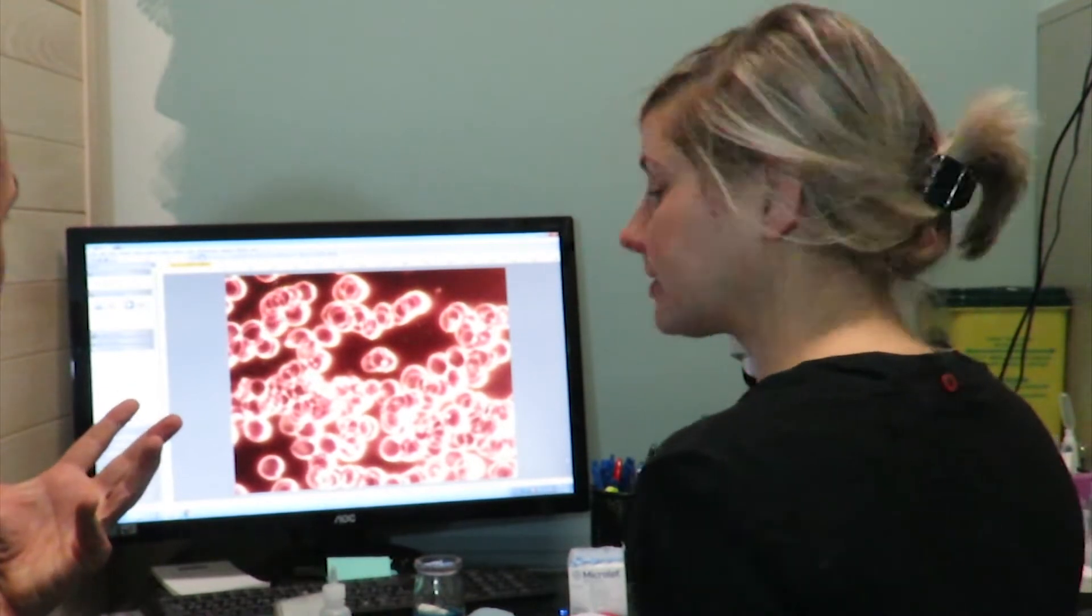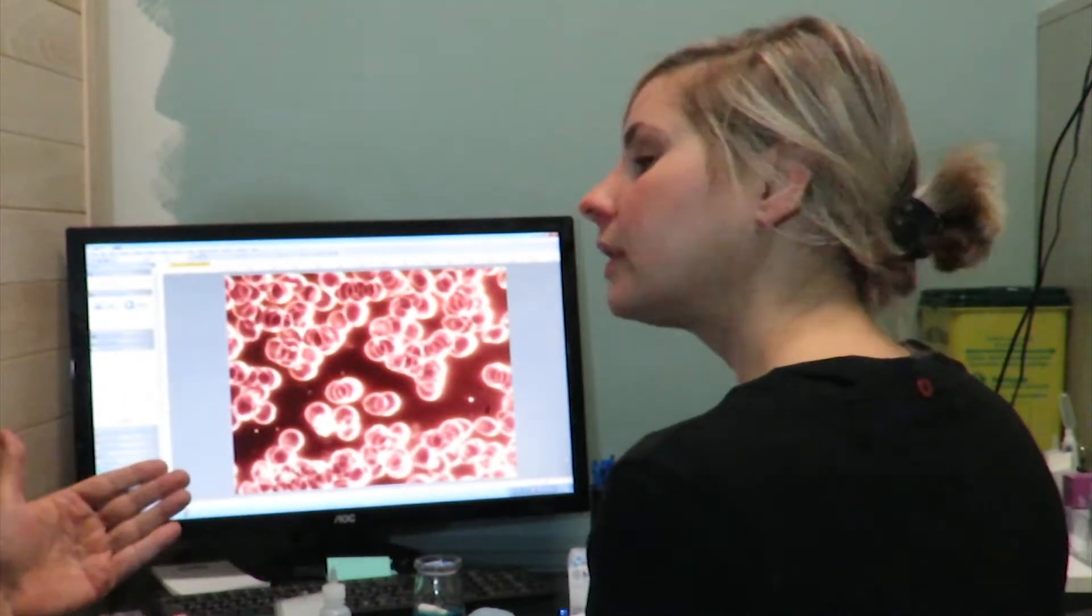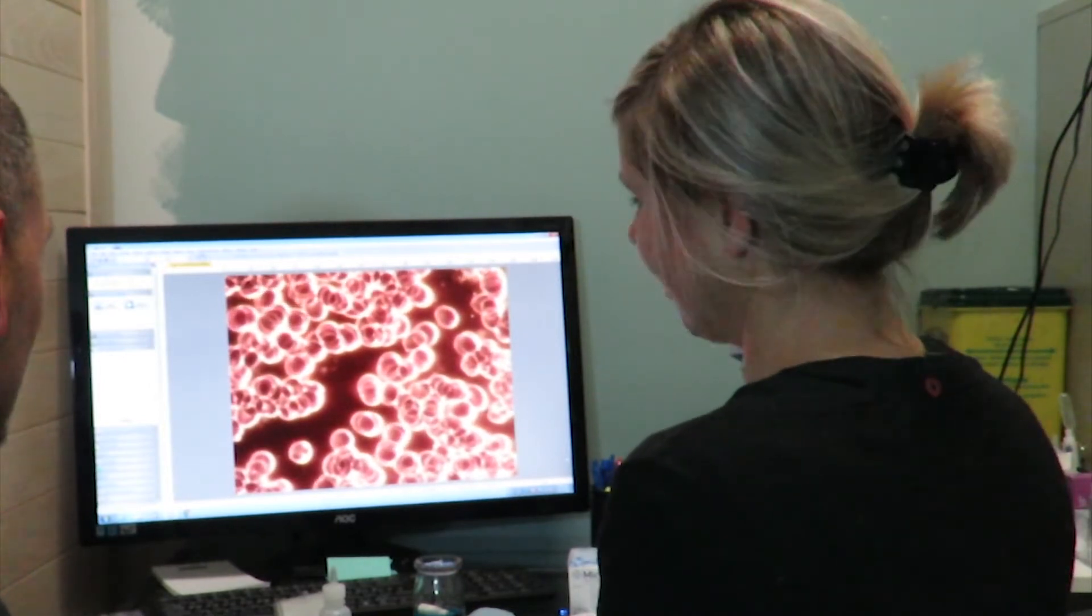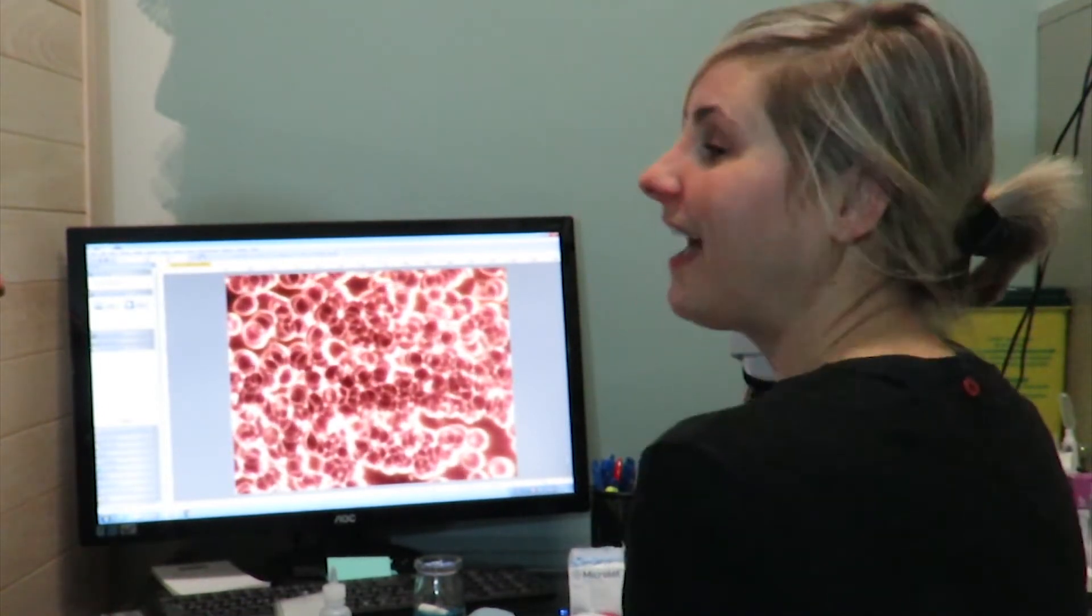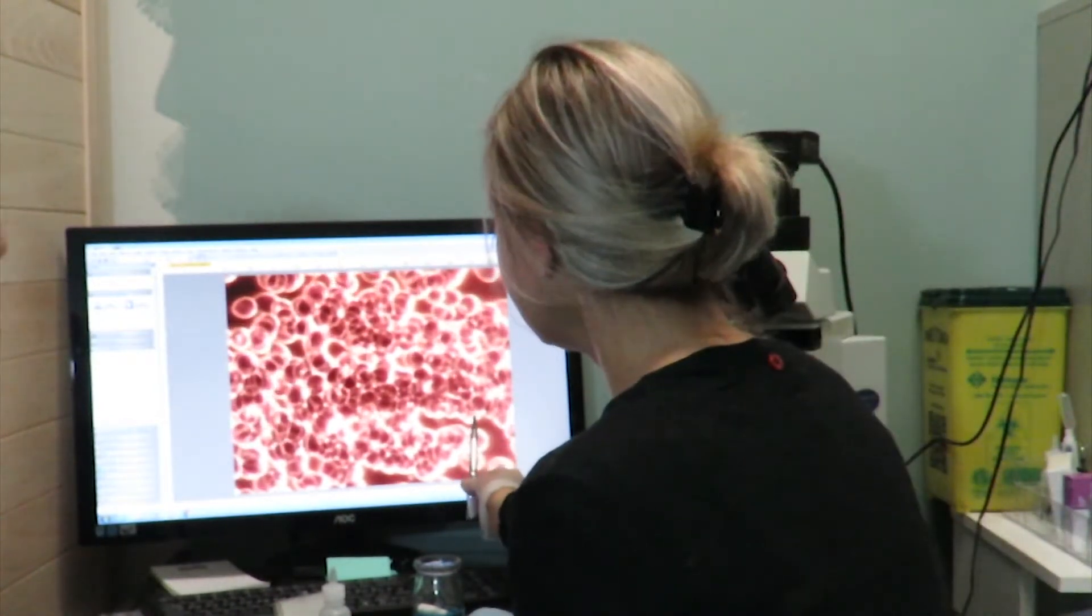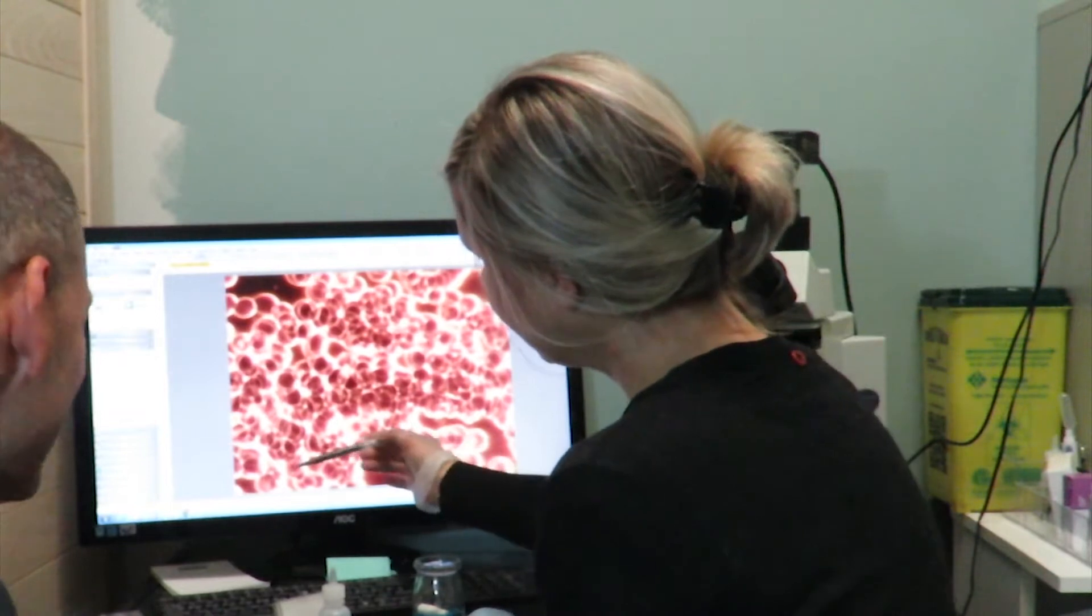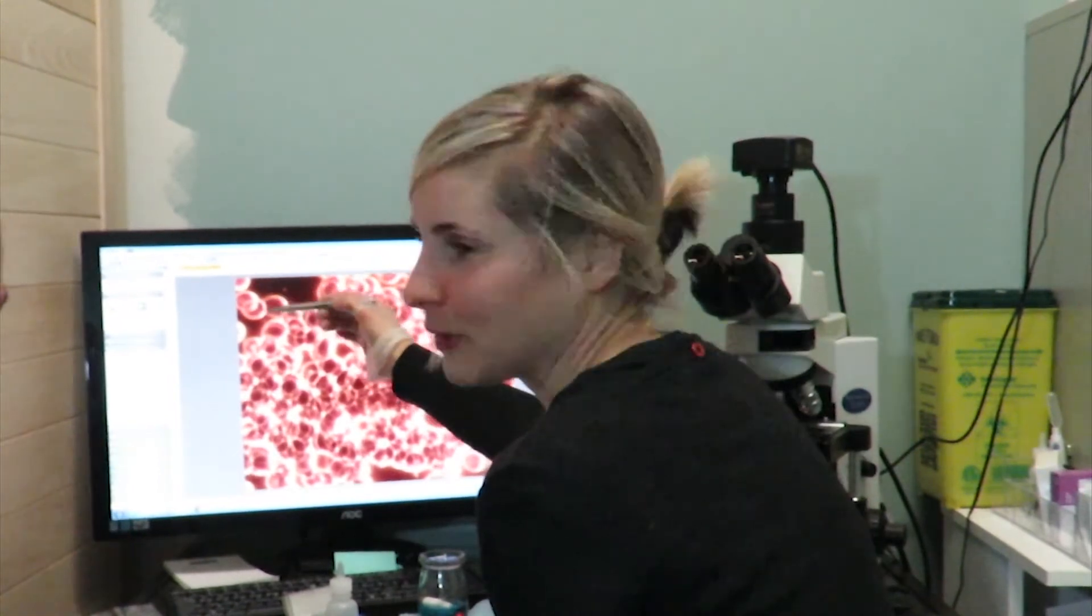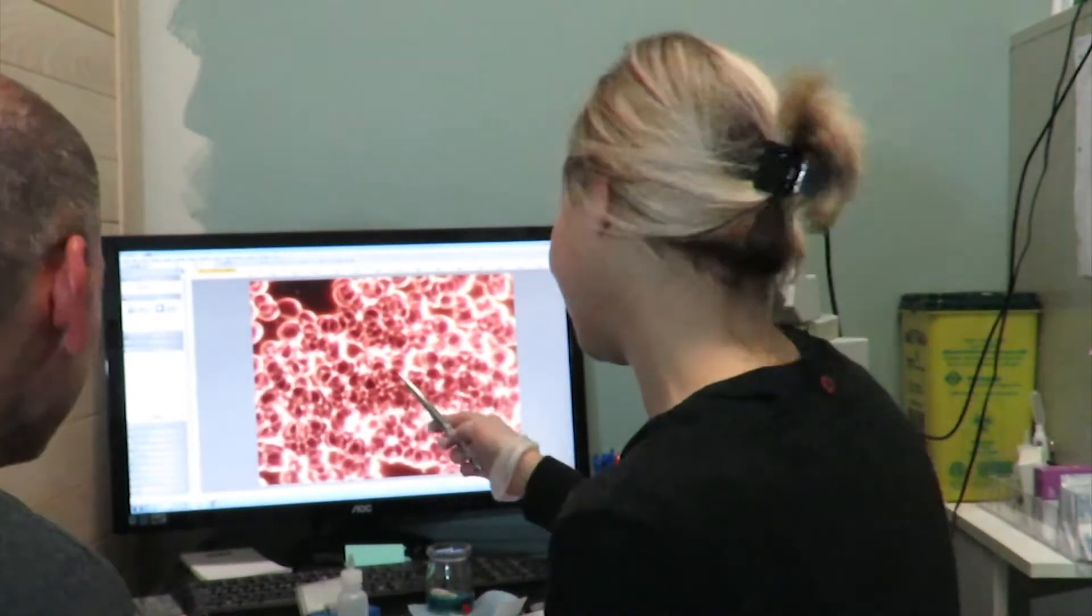So can you tell how well you're digesting? Can you tell how long ago I had it or anything like that? So at least two to three hours. Popcorn. Popcorn. So we've got popcorn digesting in here. I'm not supposed to have it, but I've been juicing, and because I've been juicing, my stomach's better, so I've been eating popcorn. Just today. How well hydrated are you? That's the question, because these cells here look a little bit like clumpy raisins. We don't want our cells to look like shriveled up raisins. We want them to look nice and round like grapes.